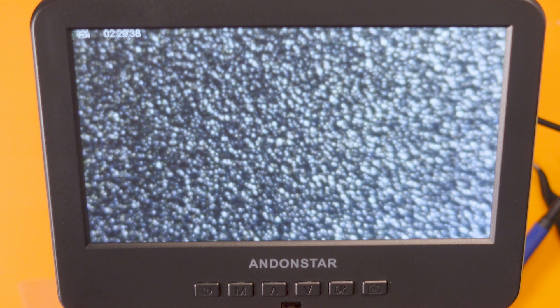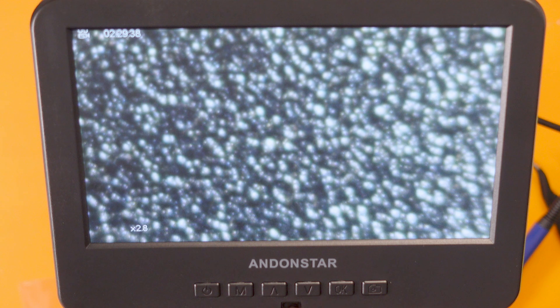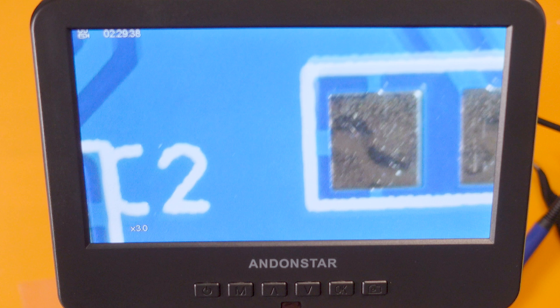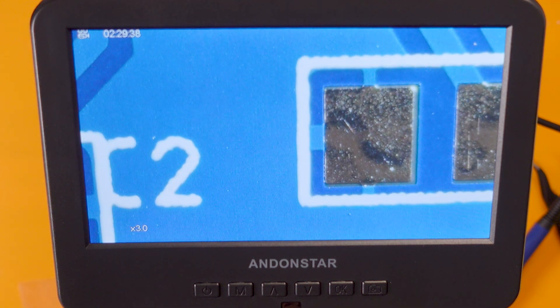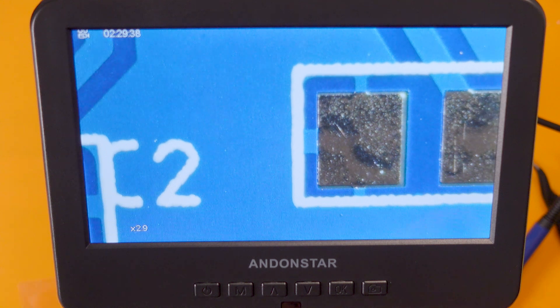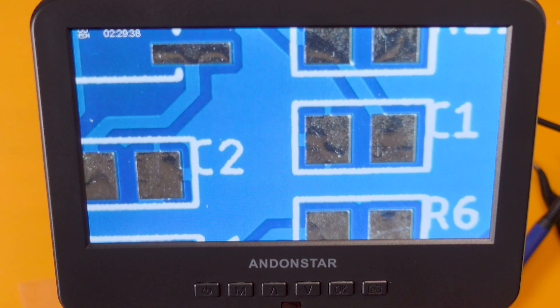It's also got a digital zoom. As we discovered, you can't change this while you're recording. Even digitally zoomed in it actually doesn't look all that bad. We've got three times digital zoom maximum. So that's pretty cool — you can leave the microscope high up giving you a slightly better overall view and then zoom in digitally as you go.